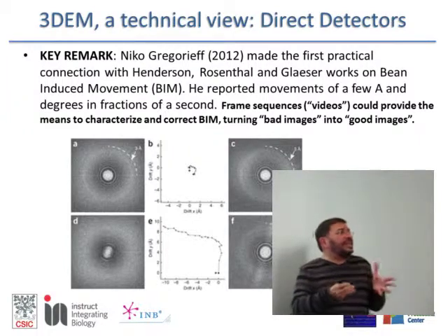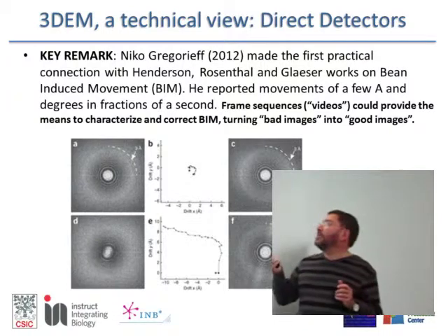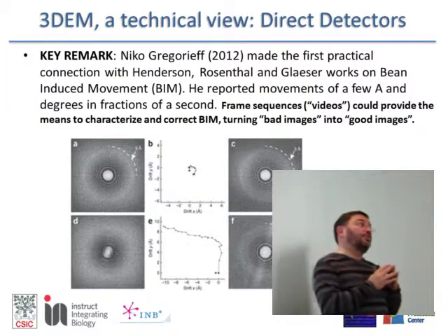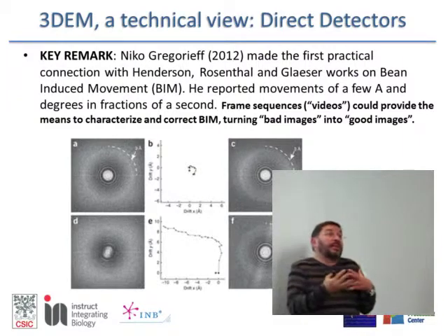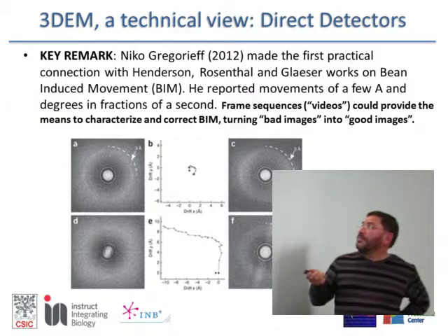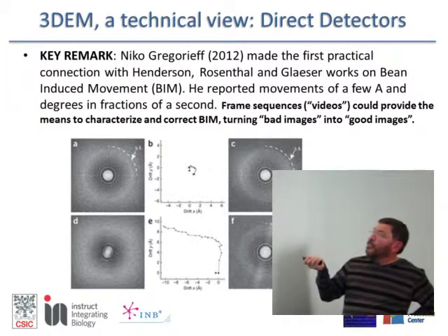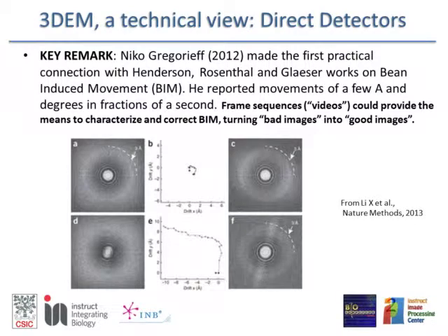Okay, with the technique that 99 times is making something bad, and 1 out of 100 times is making something good, you are not truly expecting to go to high throughput, okay? Because 99% of the time you are in problem. Which was the problem? Beam-induced movement. If you are now able to make many shots and correct the movement, you get almost 100% of the time the good images. So this is the revolution. So exciting times. You are at the very moment in which we know what has been hitting us all this year and how to overcome it.